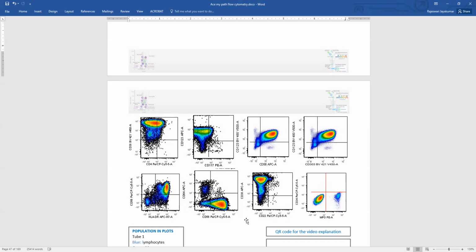One thing you have to remember is CD123 has to be positive. And CD123 is not positive only in PDCs. Actually, even myeloid leukemias will often have CD123 expression, especially the monocytic lineage ones. So CD123, CD4, and CD56. This is the combination that most labs use. Not every lab uses CD303. Very rarely they use that. The most common markers they use are CD123, CD4, and CD56.